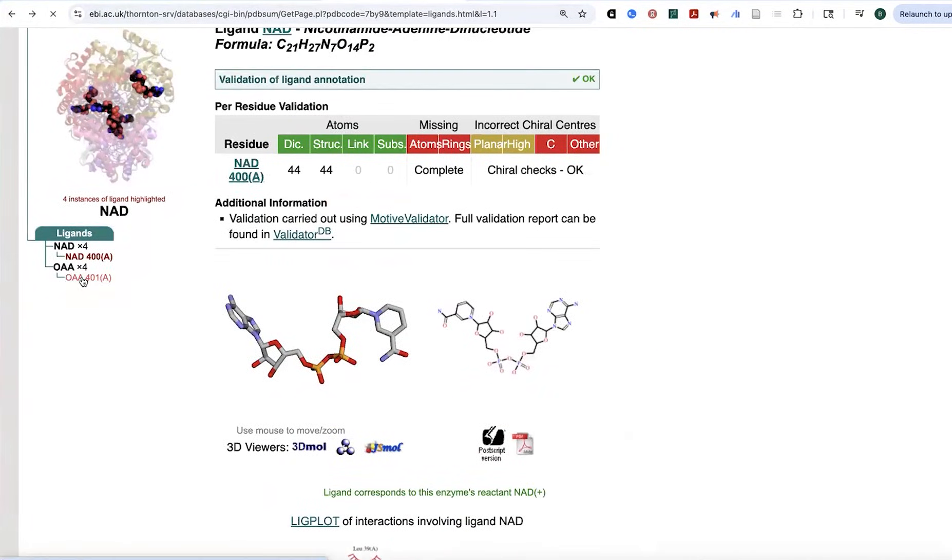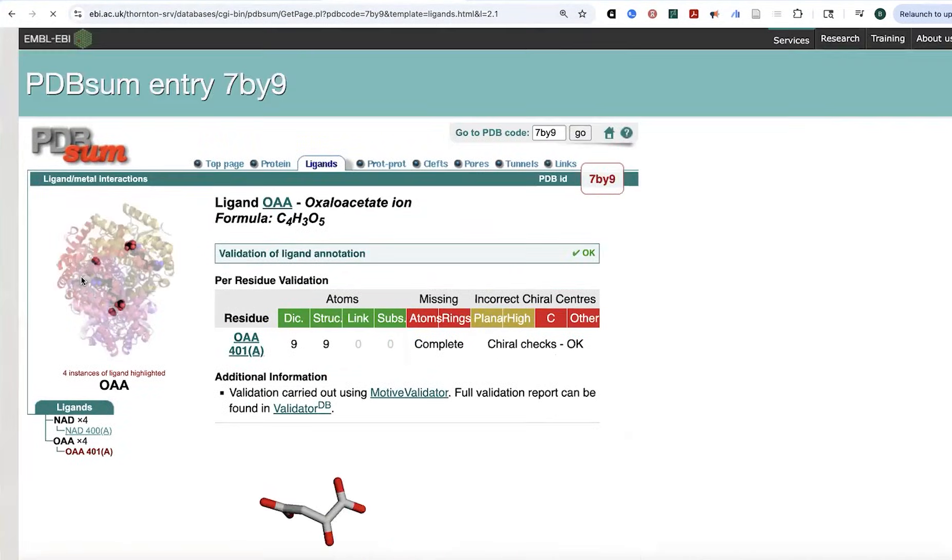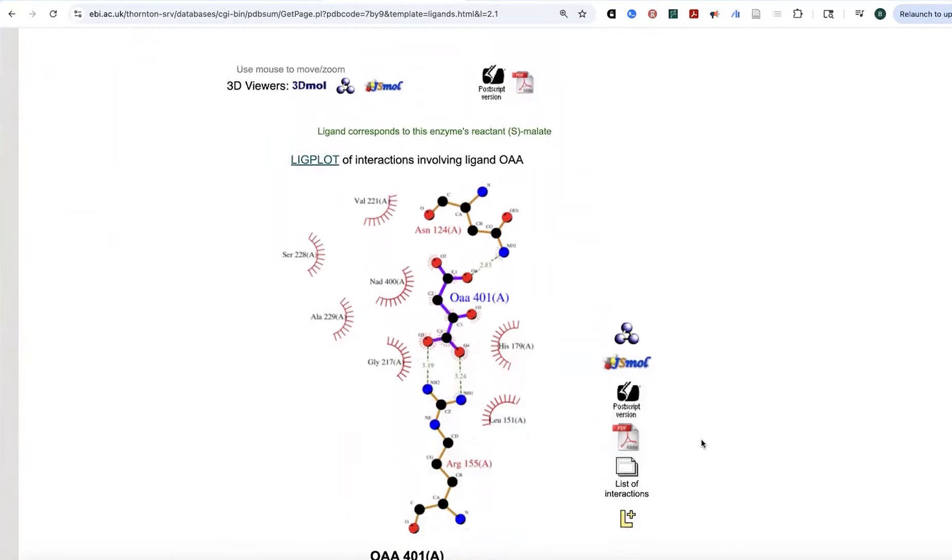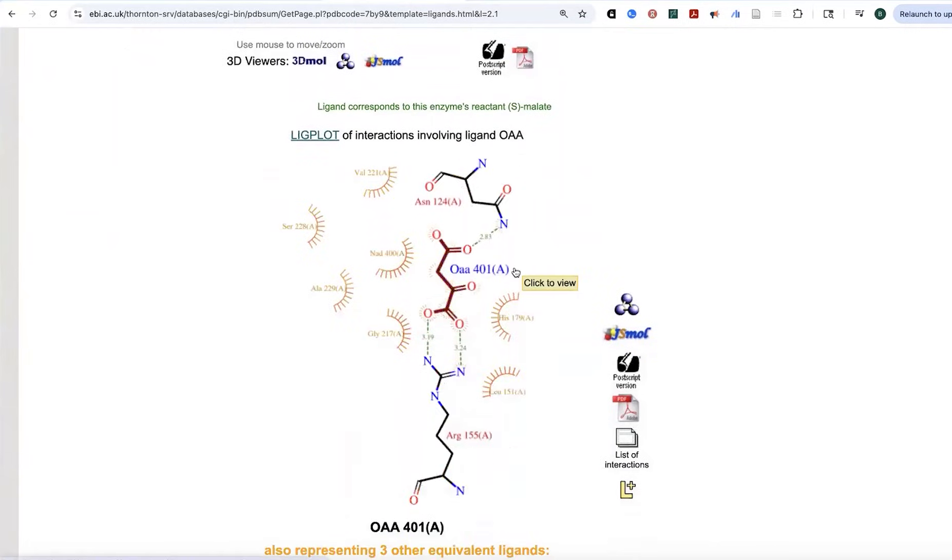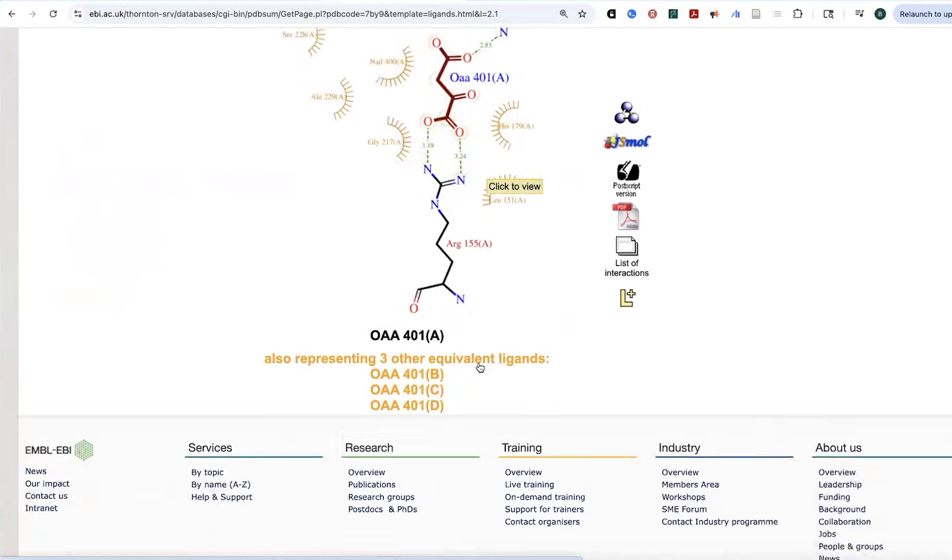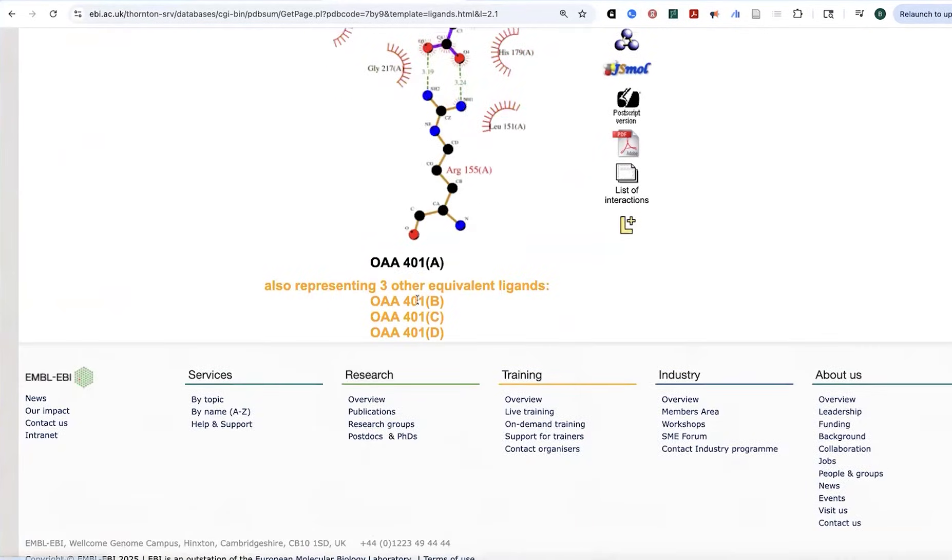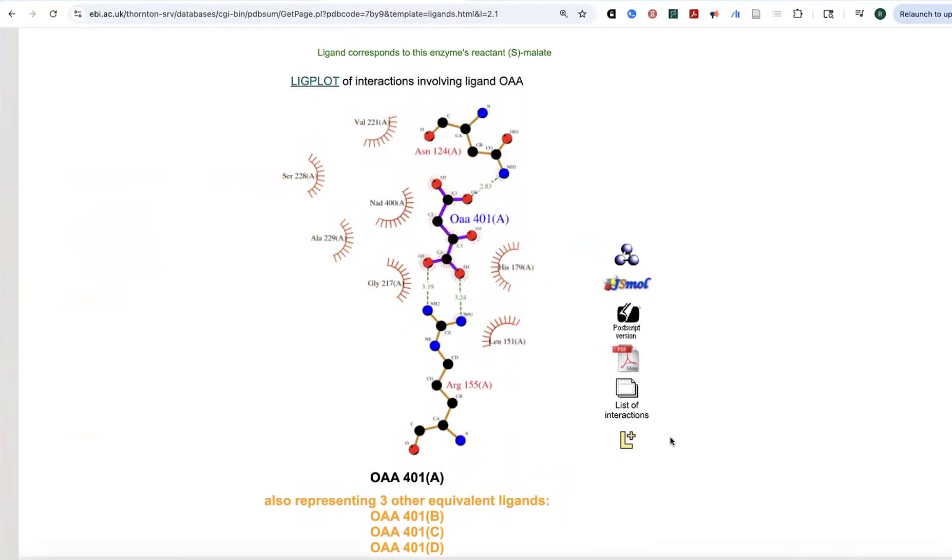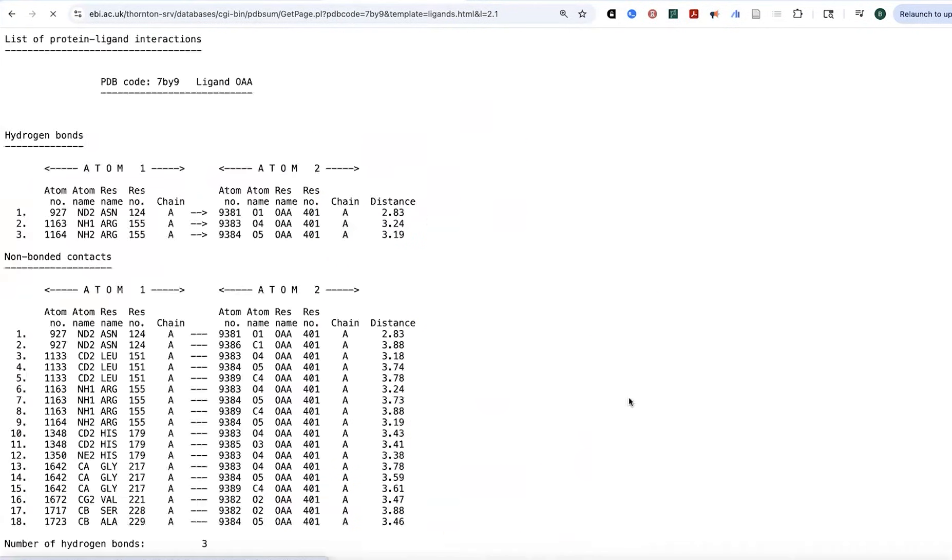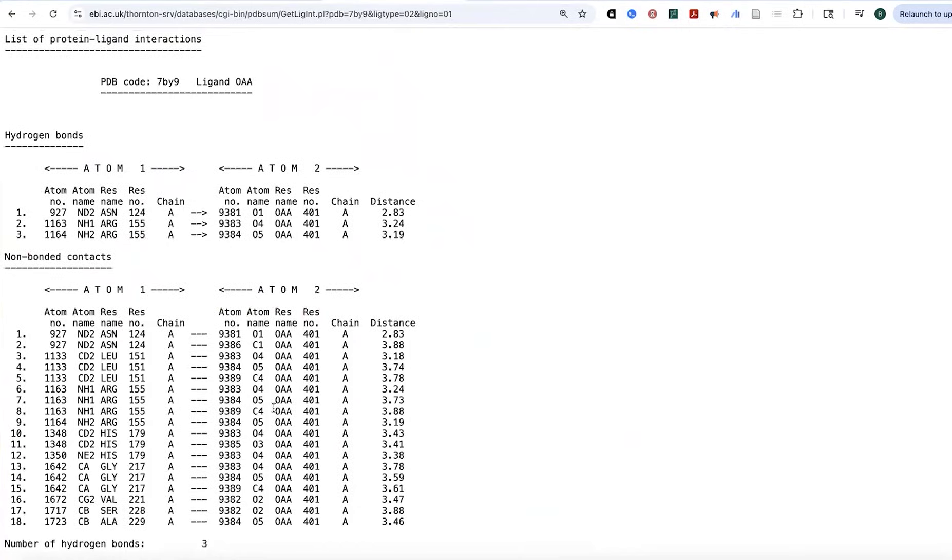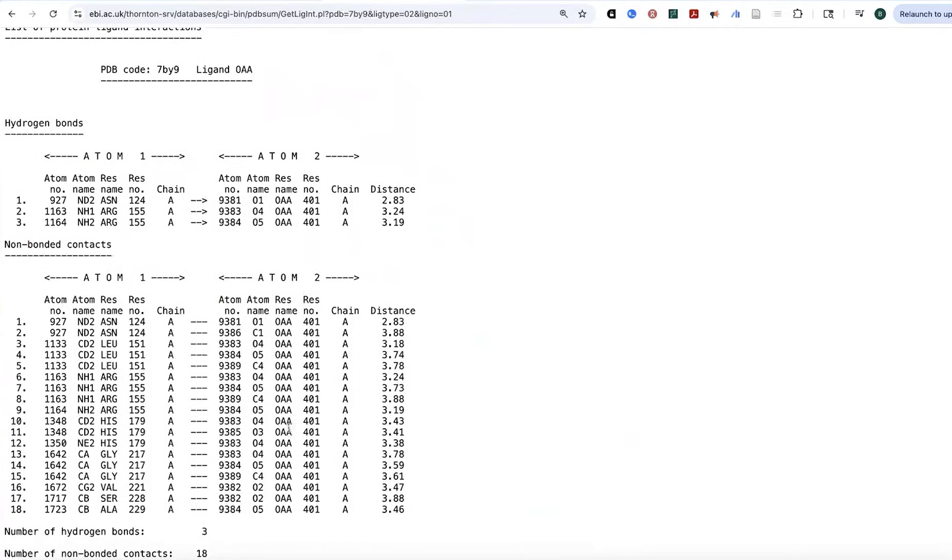That was the NAD. Now let's go to the oxaloacetate. We're going to see something very, very similar. Here we have, we can see that we've got the salt bridges and we've got these hydrogen bonds and more non-bonded contacts. And it's telling us this is equivalent, all these are equivalent in the different subunits. If we go to list of interactions, again, we'll see this and we can see the distances.